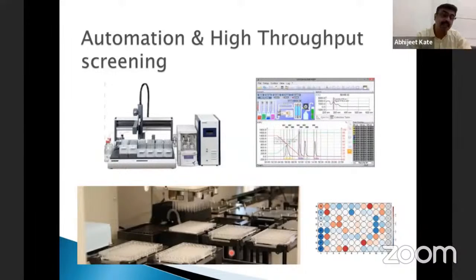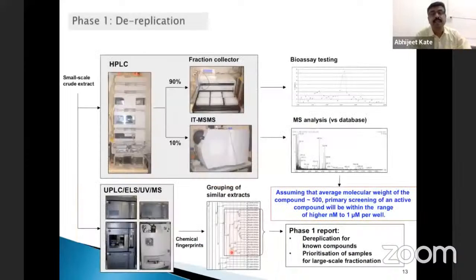Phenotypic assays can be done through this kind of technology, and then we can speed up the process very nicely. This is also one of the setups that we used to have. It looks a little bit shabby, I would say, the HPLC and the fraction collector, but that is how labs are. You are running 24/7, and there are several connections, and we are trying to collect all the information in one analysis. That is how we use it.